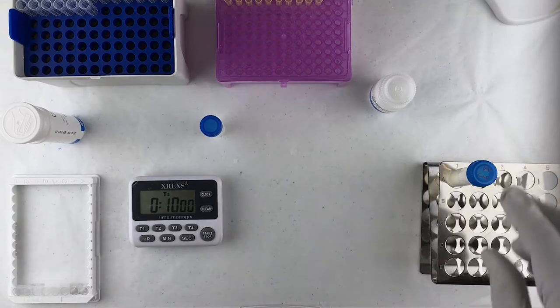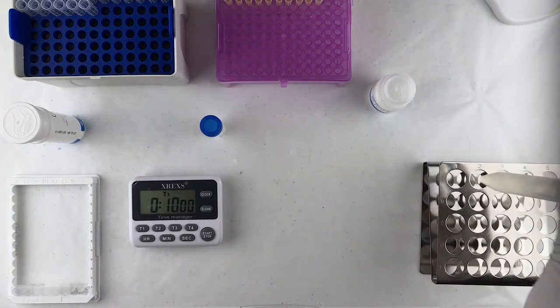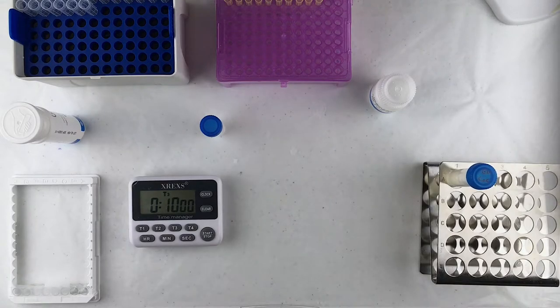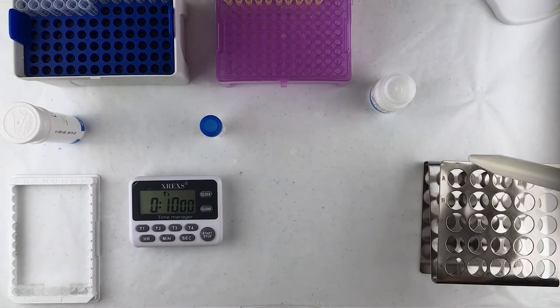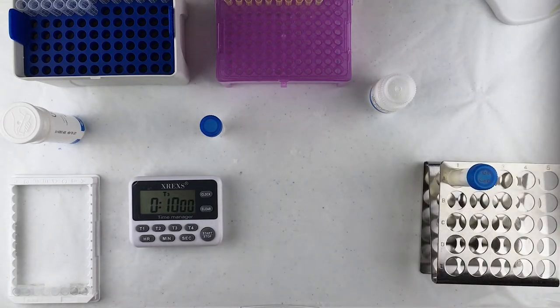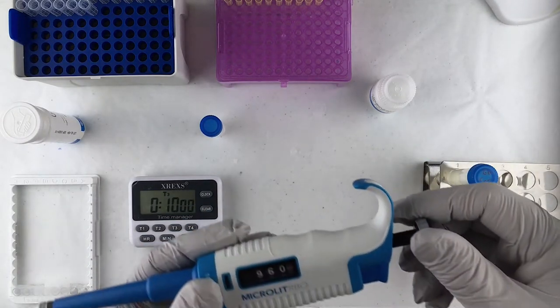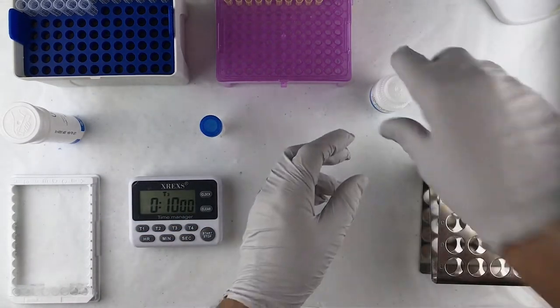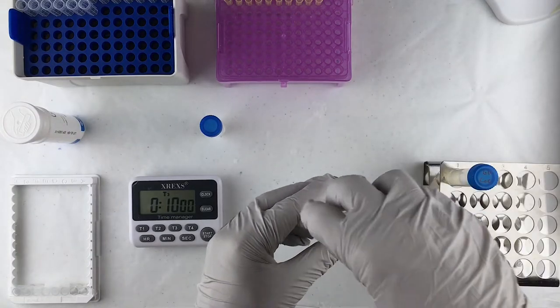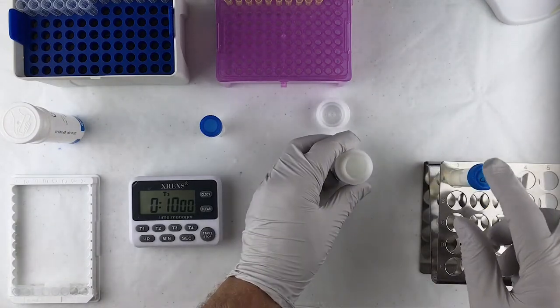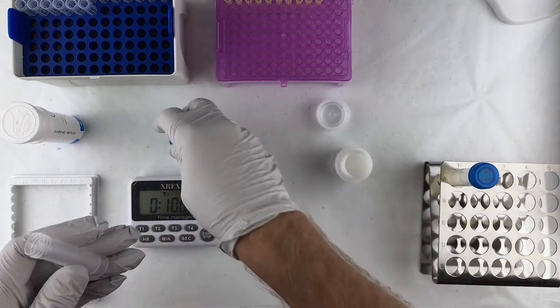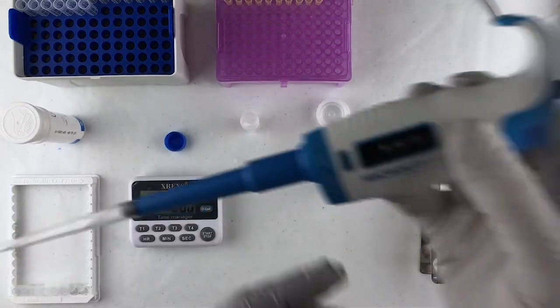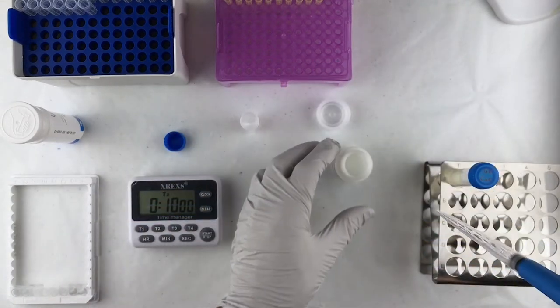Now we're going to be analyzing this at a limit of detection of three parts per million. Now what that means is for three parts per million we've got to use one to 25 extracted food sample to dilution solution ratio. So we're going to start with the dilution solution and basically we're going to take 960 microliters of the dilution solution and mix it with 40 microliters of the extracted food sample. We're going to do it in this empty vial right here. So I've got my pipette set to 960 microliters.